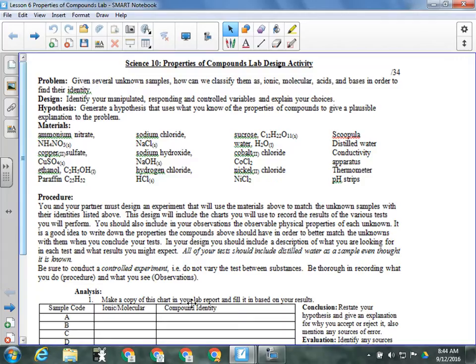For the liquids, there is an eyedropper, that thing that you squeeze and stuff goes up in. Those need to stay in the container that they are in. If you use one scoop from one in another, you'll contaminate the entire sample. I have 3 classes that need to use this, and Mr. Hesh has 2 classes that need to use this. So we would prefer not having to throw away large amounts of sample because you decided you needed the spoon from A for B. Just make sure you are not using it in more than one container. Keep it in the container.